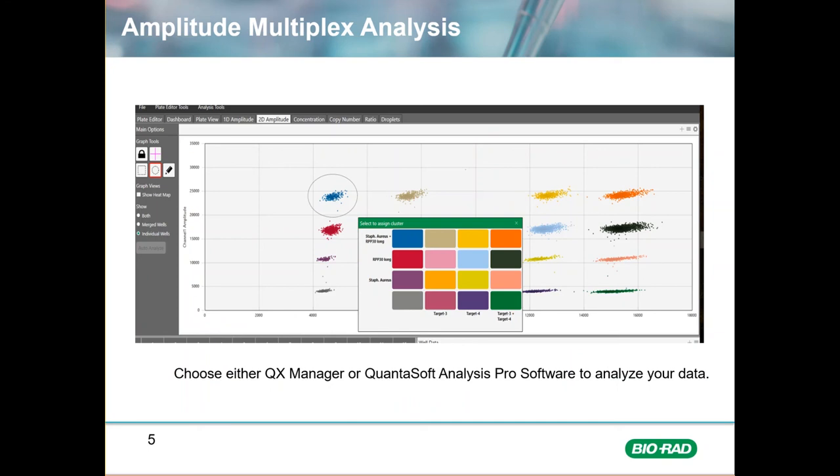The analysis is simple when using Quantasoft Analysis Pro or QX Manager. After opening and selecting amplitude multiplexing in the assay information box, the software will provide a guide to make clustering easy. Just follow the guide to label each cluster.